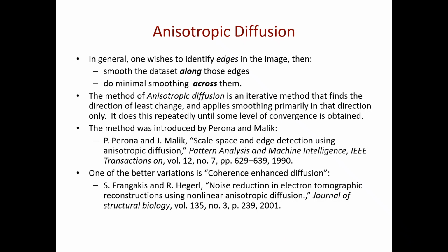Then I have those ring artifacts that make a round. One bad pixel in a detector makes a round through my image, right? So it's ultimately correlated, so it's not random. My median filter will not remove a ring artifact because of that.